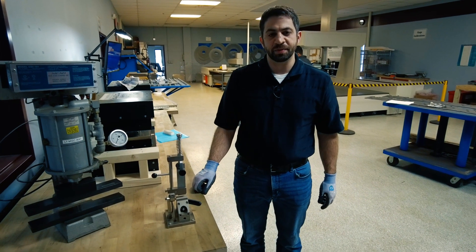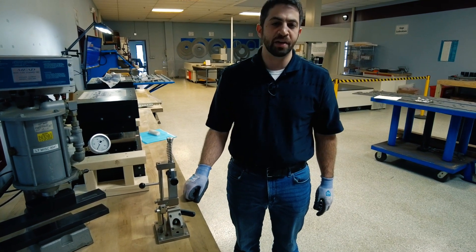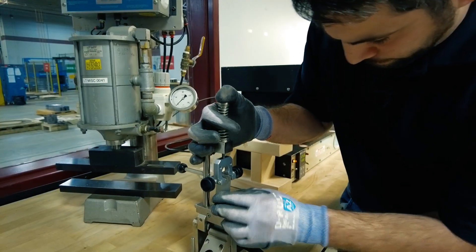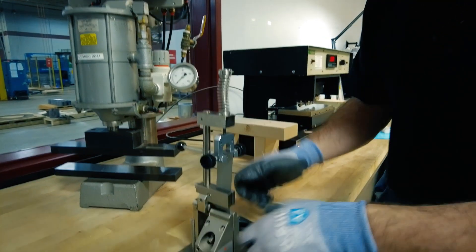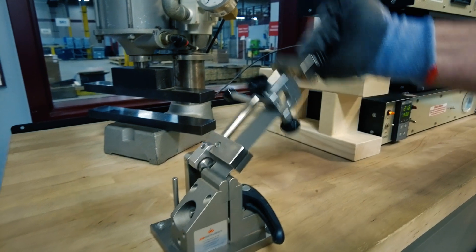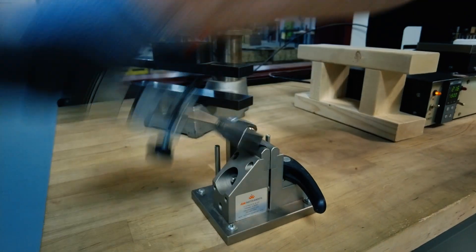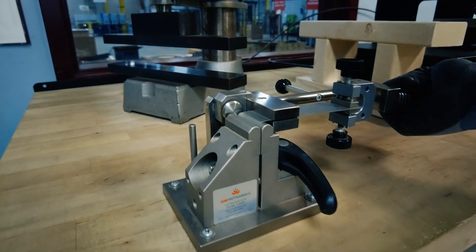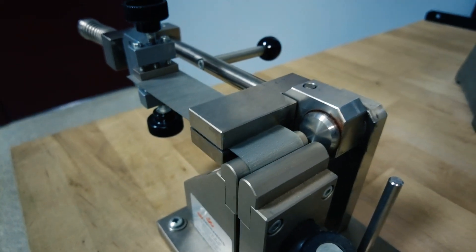This is our ductility tester. It's governed by ASTM A720 and it's used for testing non-oriented electrical steel. We'll take our standard size specimen, secure it to the mandrill, and count the number of bends until we start experiencing fracture — and there I just heard it.